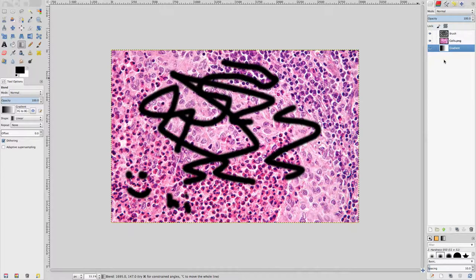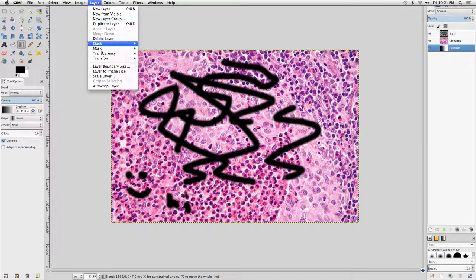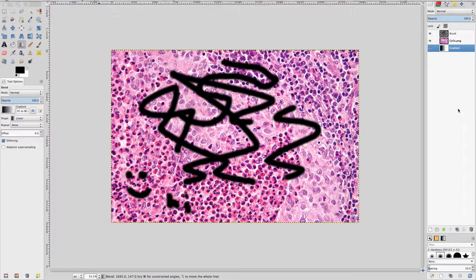There are lots of powerful ways to duplicate and combine layers that should be explored. GIMP's native XCF file type will save and preserve image layers. Many bitmap image file types cannot preserve layers and will merge all visible layers into a single layer when exporting.